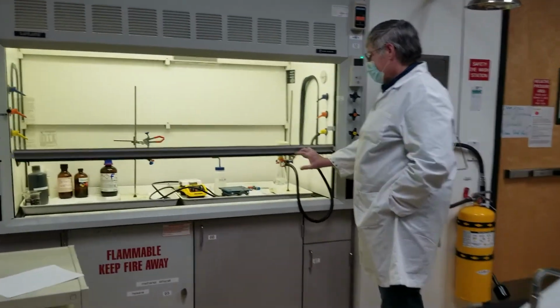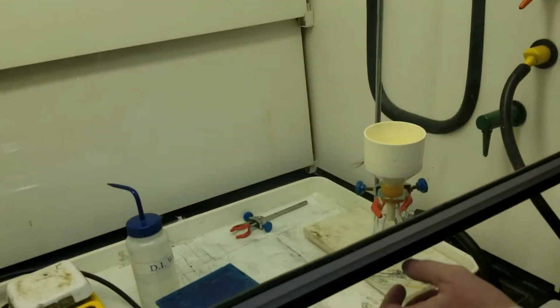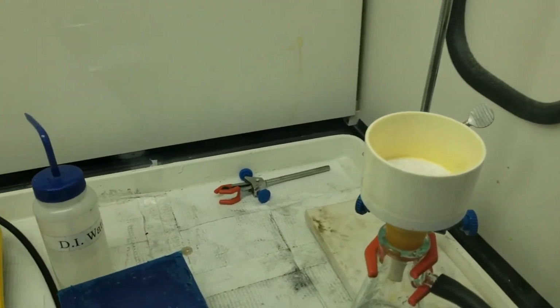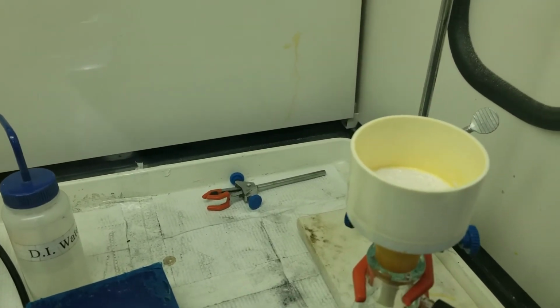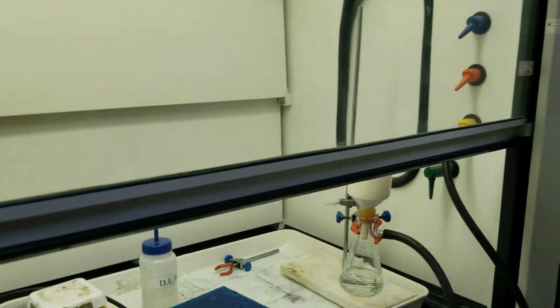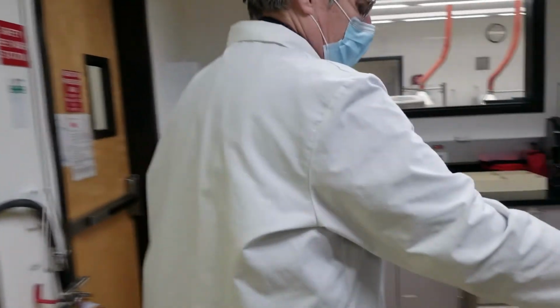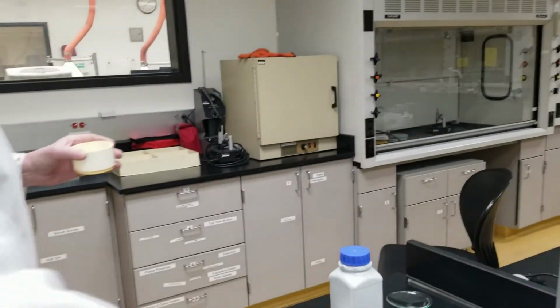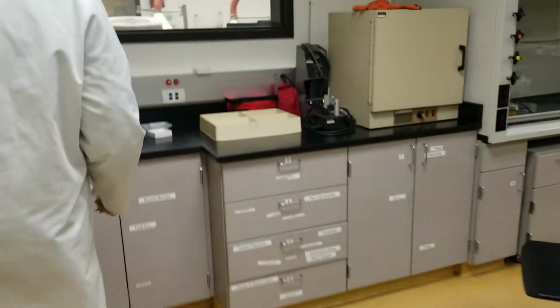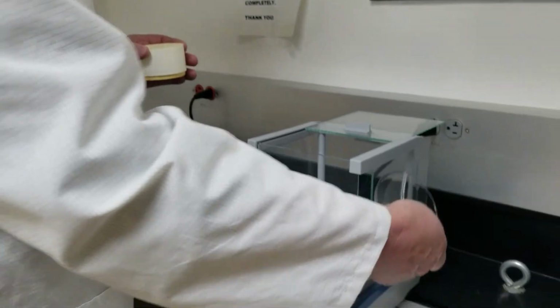Okay, we've been drying our products now for half an hour. If we look down inside, you'll see they're nice, shiny, flat looking crystals. They have a bad habit of blowing away in the breeze. We are now going over to the scale to weigh our final yield. So let's take this with us very carefully, and our watch glass and our spatula. First thing we have to weigh is the watch glass itself.